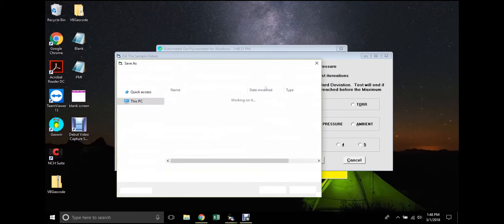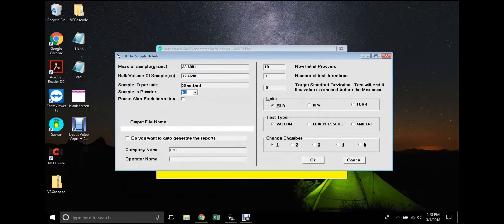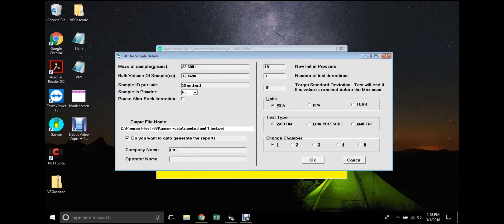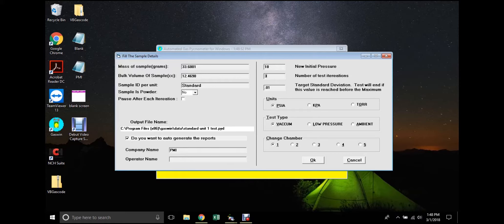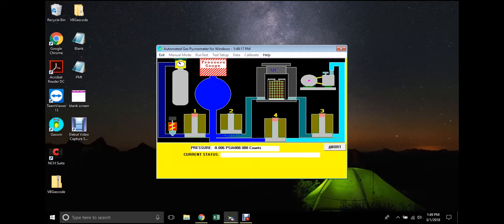Choose an output file allows the user to name and choose the save directory for the output file generated by the test. There is also an option to auto-generate a report from test data. Initial pressure and number of iterations may also be specified. In this example, three iterations will be run. If results for the first two iterations are reproducible, the third iteration will be bypassed. Options for units and test type may also be selected. When all parameters are set to desired values, the user may click OK and the test will begin.